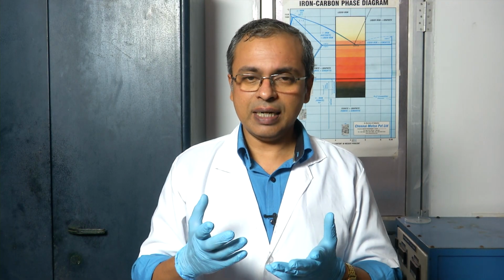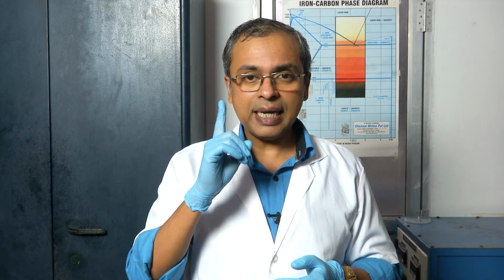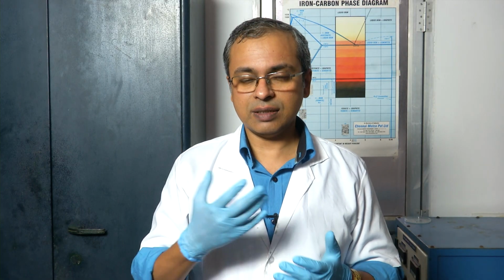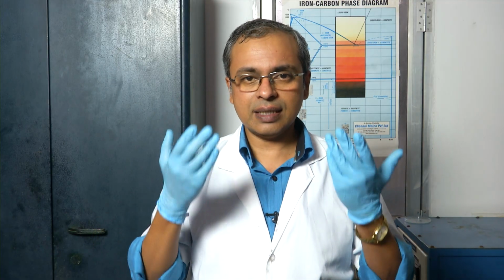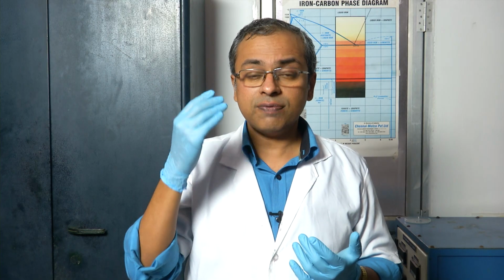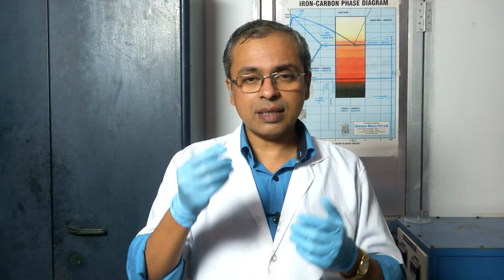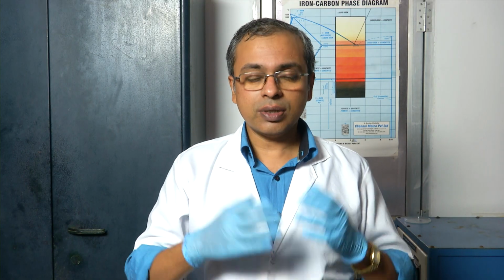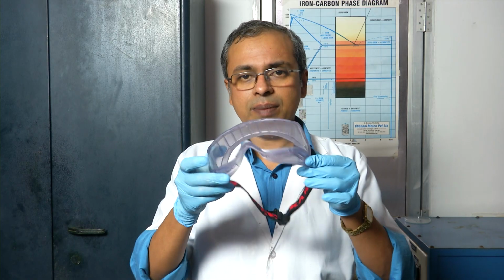So, therefore, we have safety glasses which do a much better coverage of your eye. That is something I am going to show you. One aspect that this glass is not good at is the coverage that it provides, but there is another aspect in which it is not sufficient as a safety device, and that is that this is not shatter proof. This is just glass. If something strikes it, depending on the velocity and the momentum it has, the glass can shatter. If the glass shatters, it is even more dangerous for your eye than simply some object hitting your eye, because now there are a lot of glass pieces which can enter your eye. So, the two things that the eye safety equipment has to do is to cover your eye and also be reasonably shatter proof.